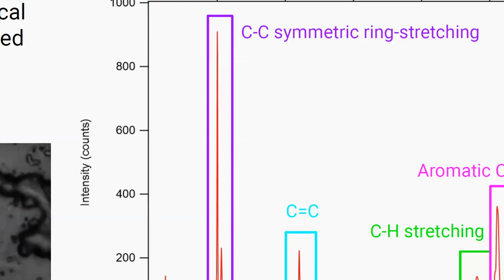What we're excited about is that we haven't upgraded to be able to do the CH laser in our lab yet, although that's happening in a few weeks. When that does, we're really excited to compare the CH stretching regions for the Raman and the IR and start optimizing our matching, particularly accounting for things like weathering of the microplastic.